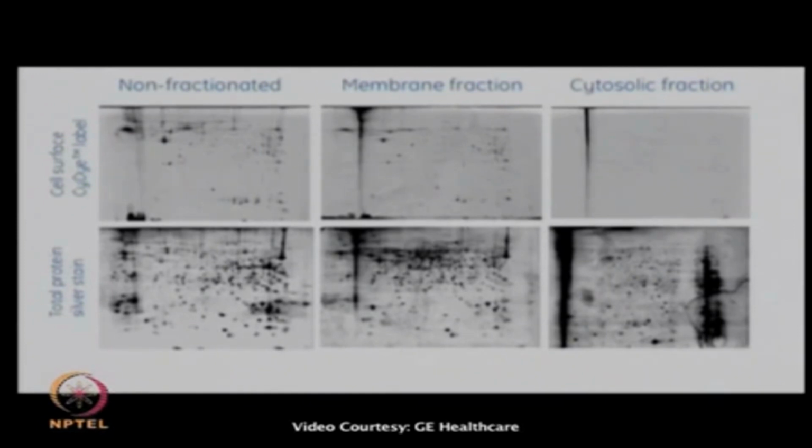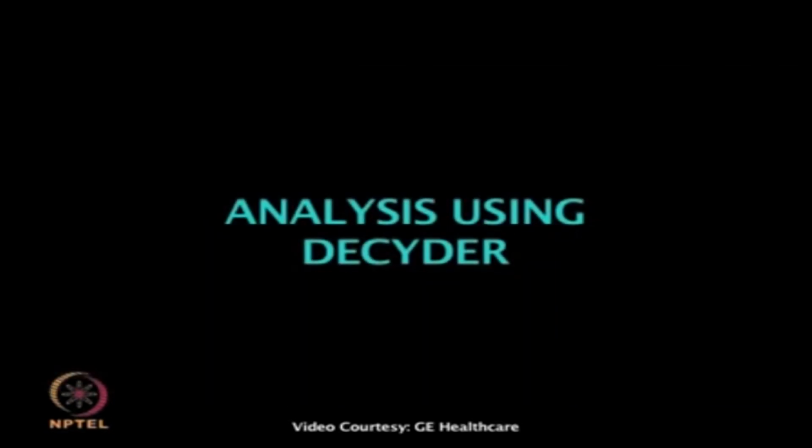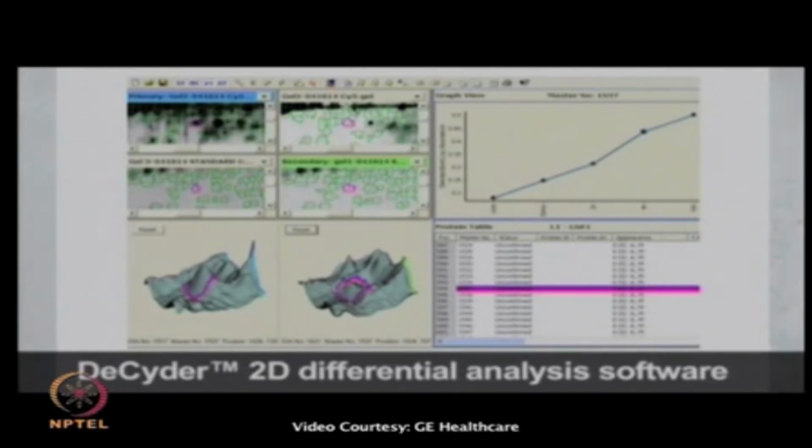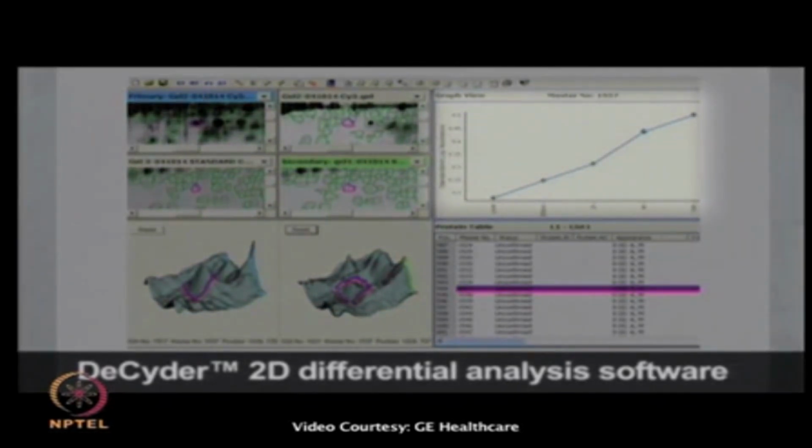Cy2, Cy3 and Cy5 show similar labeling patterns and are all compatible with the cell surface protocol. A DIGE experiment was performed using all three CyDye DIGE Fluor minimal dyes for studying differential expression of cell surface proteins in CHO cells after serum starvation for different lengths of time. Cy2 cell surface samples from all samples in the experiment were pooled and used as an internal standard. The differential changes of several cell surface proteins could be followed during the starvation period.